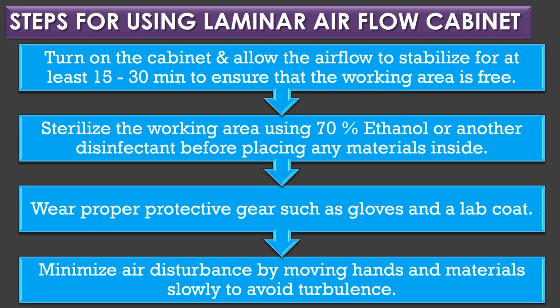Steps for using laminar airflow cabinet. In step 1, turn on the cabinet and allow the airflow to stabilize for at least 15 to 30 minutes to ensure that the working area is particle free. In step 2, sterilize the working area using 70% ethanol or another disinfectant before placing any material inside.